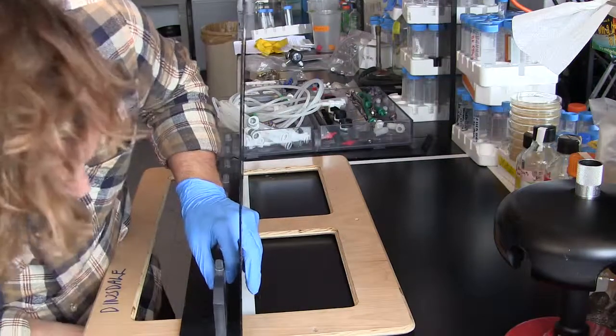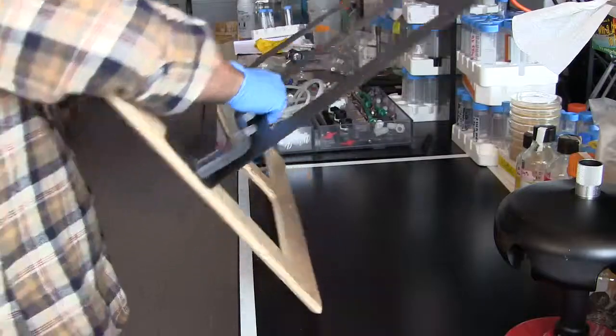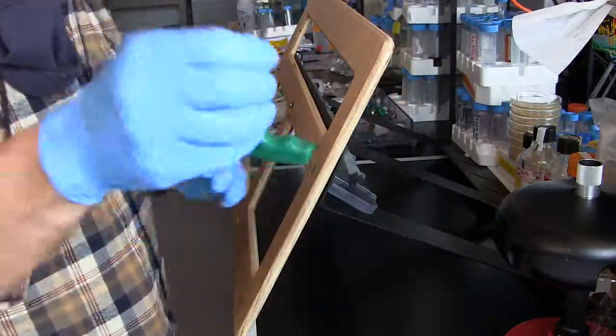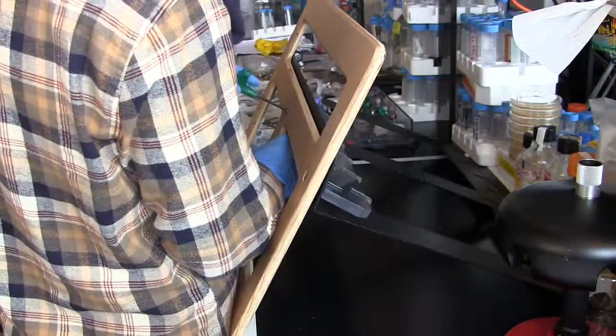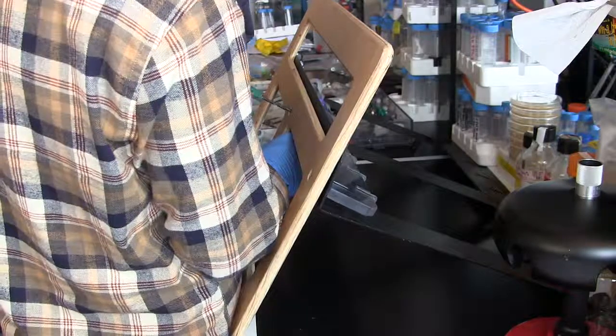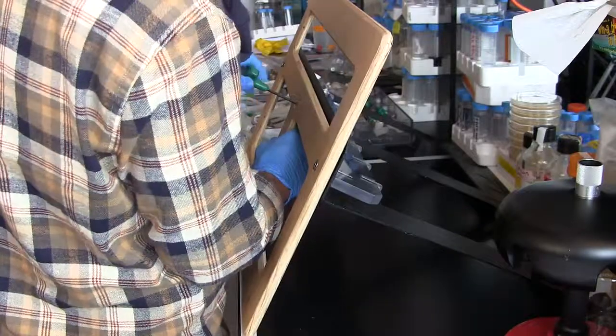Okay, I find the easiest way to put it together is standing up like this, although it may not look that way. Then what you do is you tilt it onto its back, and using the hex key here, tighten everything up. And you'll see probably in the video how things are tightening up here.